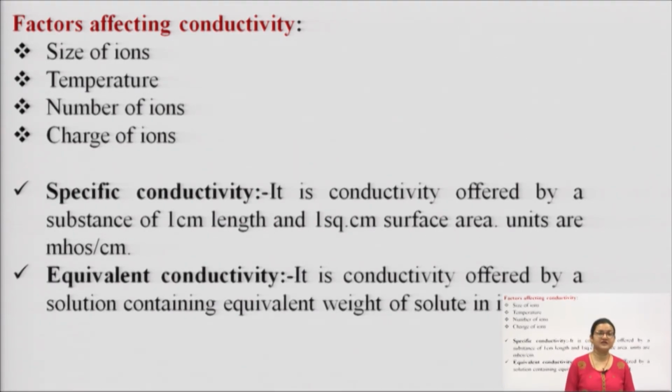Conductivity will definitely be affected if the mobility of charged particles or charged ions gets impacted.